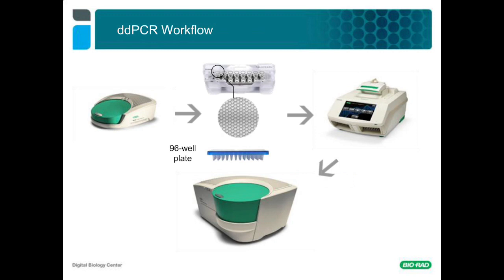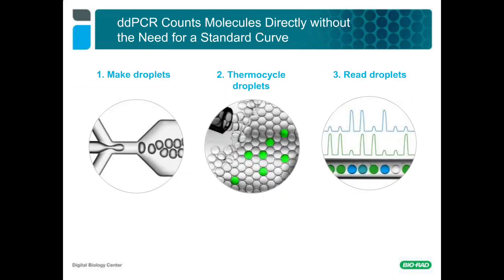Since the ddPCR reaction is read at endpoint after thermal cycling is complete, each droplet that has fluorescent signal can be counted as a positive. This results in more flexible assay design rules as well as the ability to see how well the assay performs.